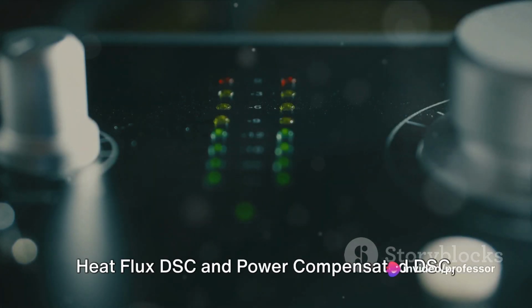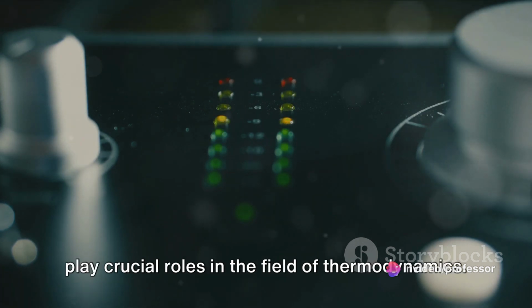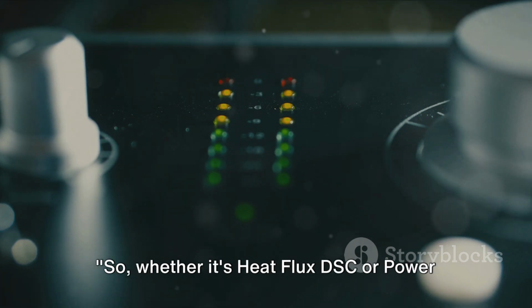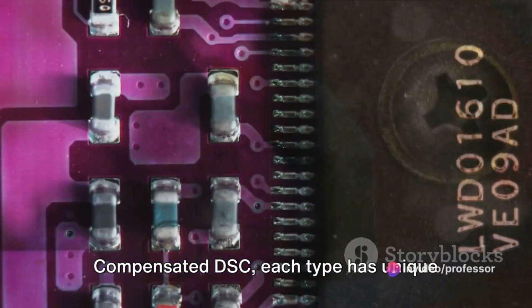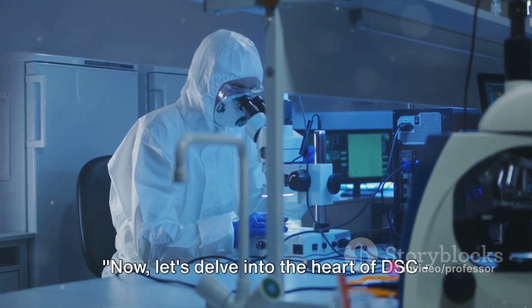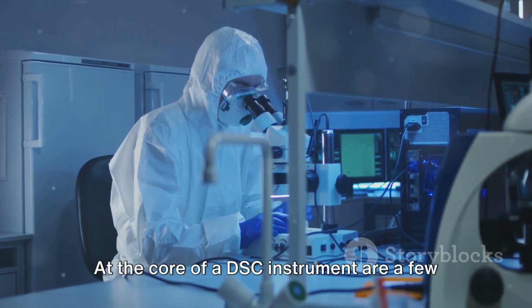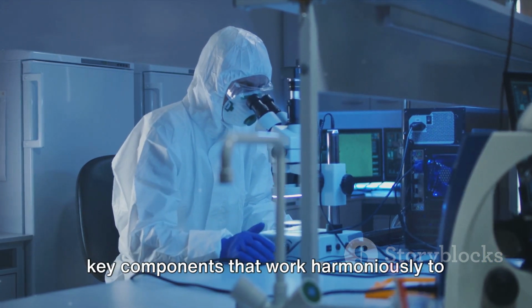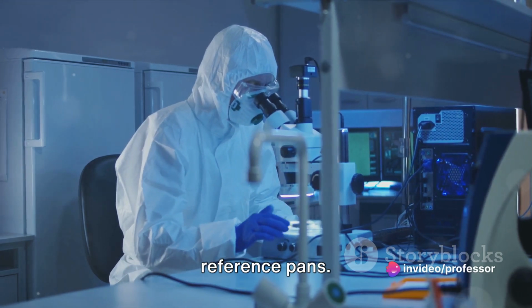Heat flux DSC and power-compensated DSC, though different in their operation, both play crucial roles in the field of thermodynamics. So, whether it's heat flux DSC or power-compensated DSC, each type has unique characteristics that make it suited for specific applications. Now let's delve into the heart of DSC. Its instrumentation. At the core of a DSC instrument are a few key components that work harmoniously to facilitate the process. The first of these is the sample and reference pans.